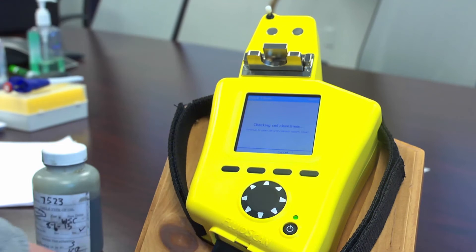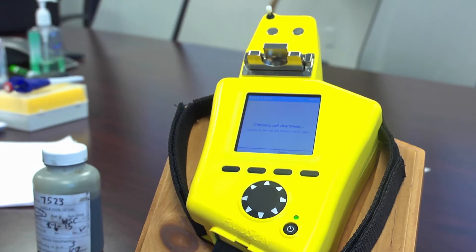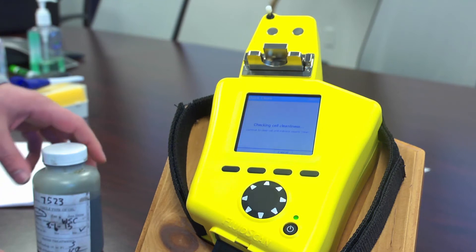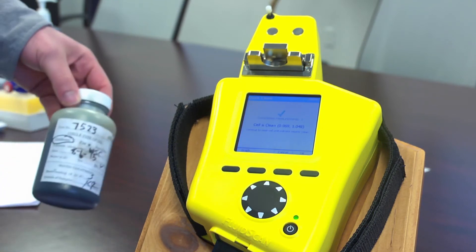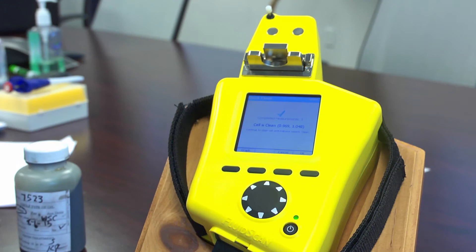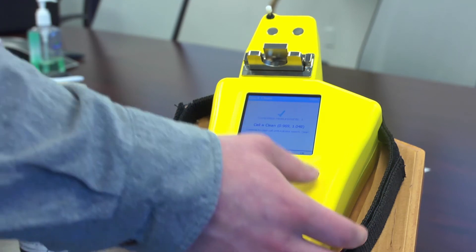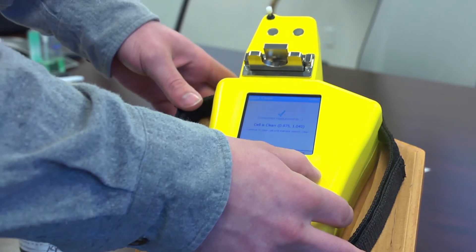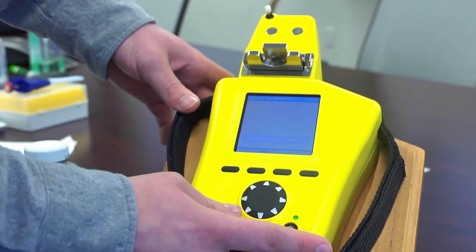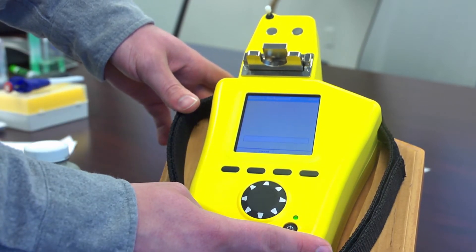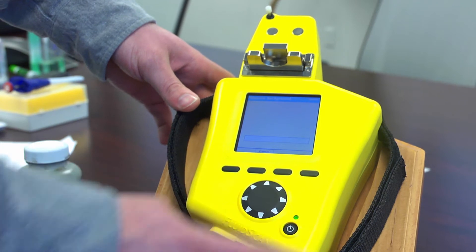The background is to basically measure the background noise inherent in the unit and it will then subtract this after the sample is taken to give an actual result of what the absorbance is. Once it is done we hit OK and it is going to measure the background.